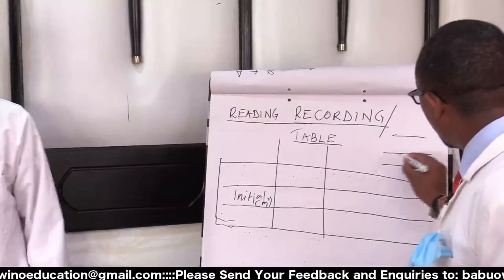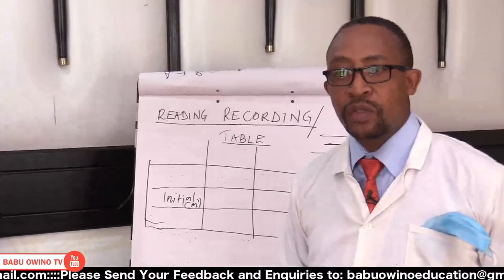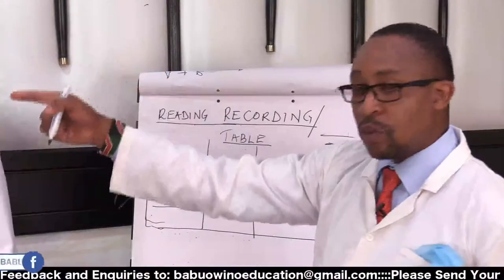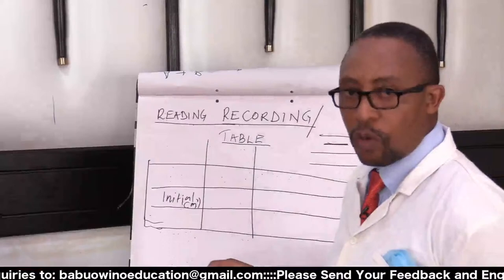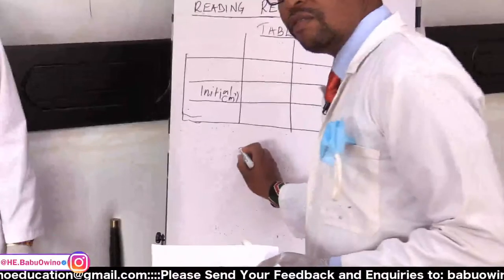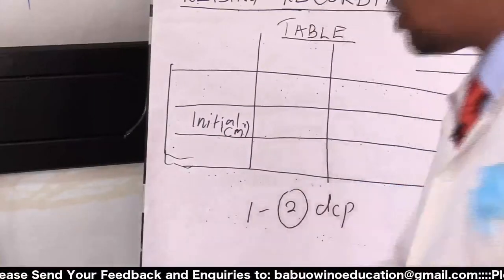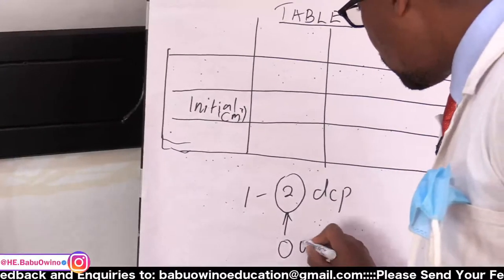But in case you find the solution is in between, you can approximate that to the nearest 5 or 0. So that reading could have been either 1.80 or 1.85, but cannot be 1.82. Note that in titrations, we always give readings to one or two decimal places.